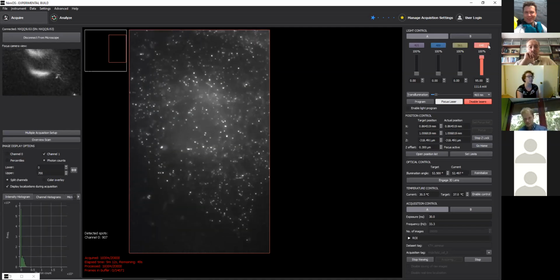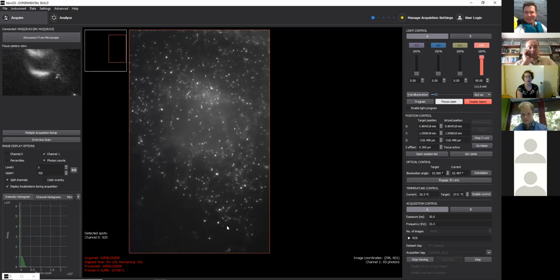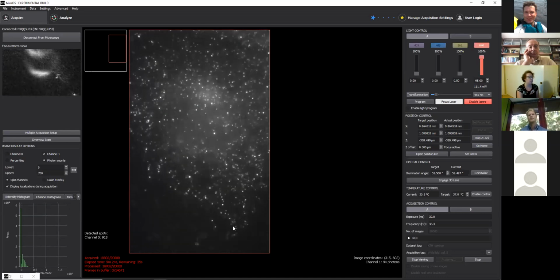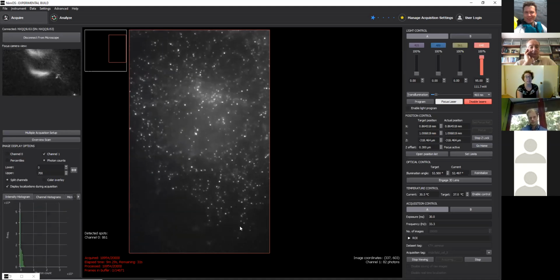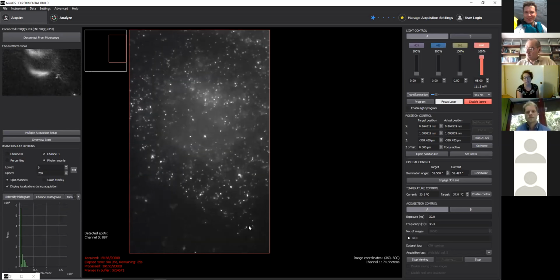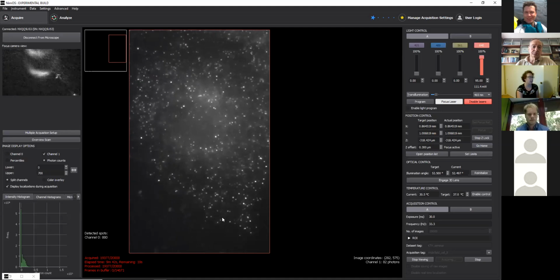And what I've done is basically used all of the conditions necessary to get a DStorm image. So you can see here, I've applied a very high laser power, and this is to induce the fluorophore blinking. One of my colleagues has placed this sample in a DStorm buffer, which is an oxygen scavenging and reducing buffer. And we're using a fluorophore Alexa Fluor 647, which is a really common fluorophore used for DStorm imaging. It's actually the best fluorophore to use for DStorm imaging, and it's also a widely available commercial fluorophore. So that makes this whole process fairly simple.